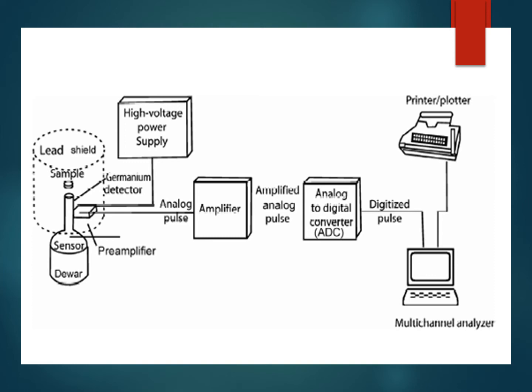So in this way we can have the signals of our required substance, or the amount or quantity of the desired substance can be seen in the form of a graph, or the signal can be interpreted on a piece of paper.